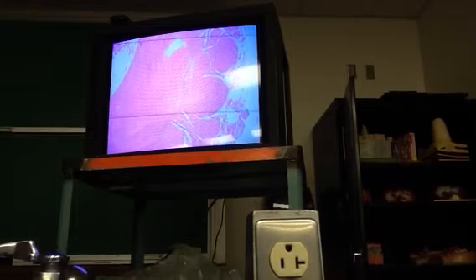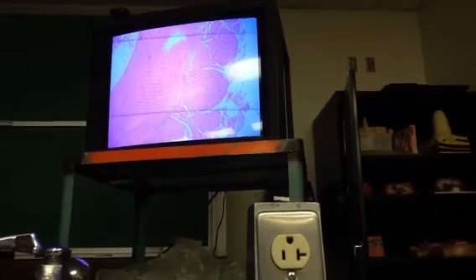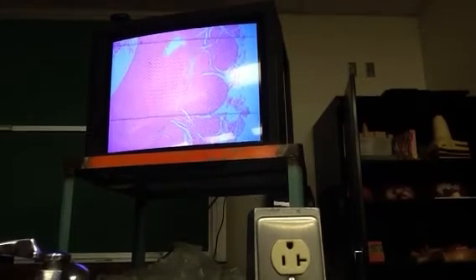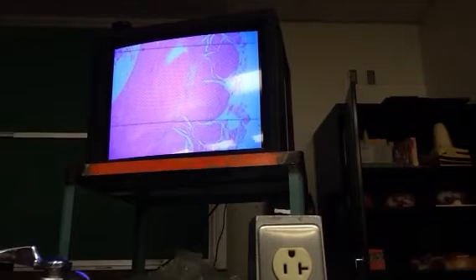In a cross-section view, the circular is going to look like that. Longitudinal will look like this, which is what we've got there. But when we had the other one, the inner one looked longitudinal, because it was a longitudinal section for the other one.